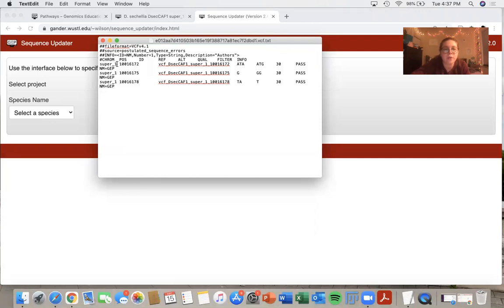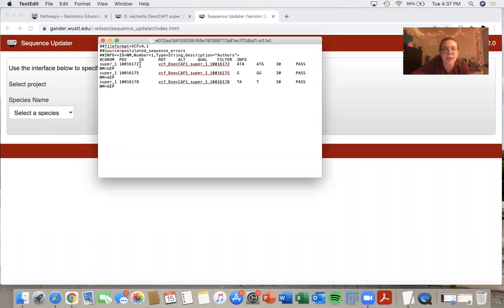So the chromosome is my scaffold that I was on. So that's super_one. The position tells me the base number. And I had three different base numbers for the three different changes that I wanted to make.